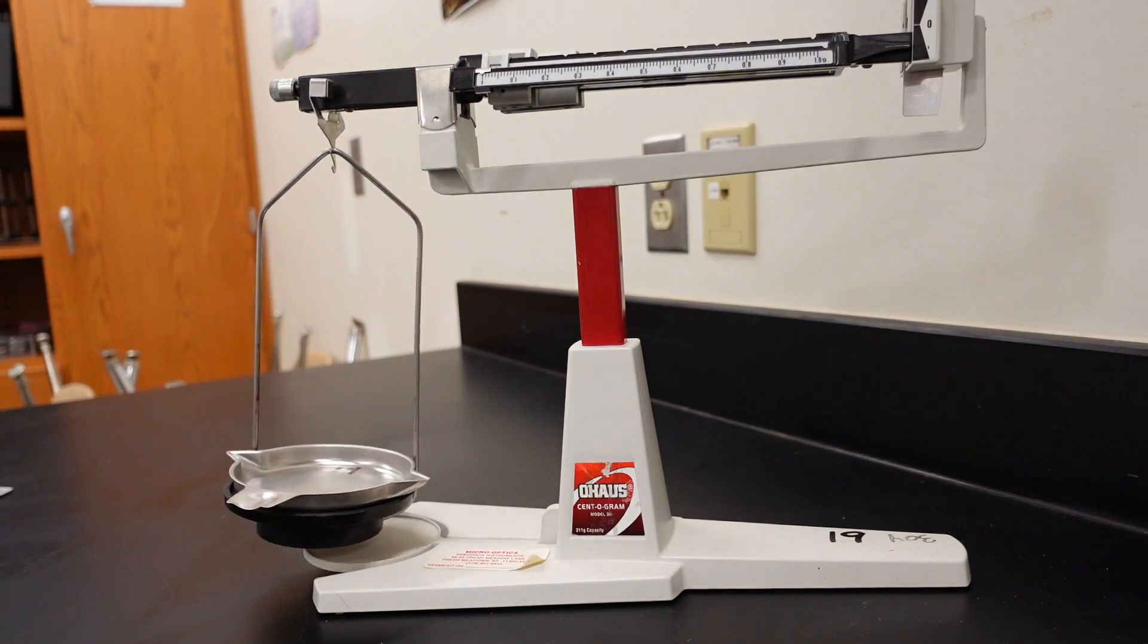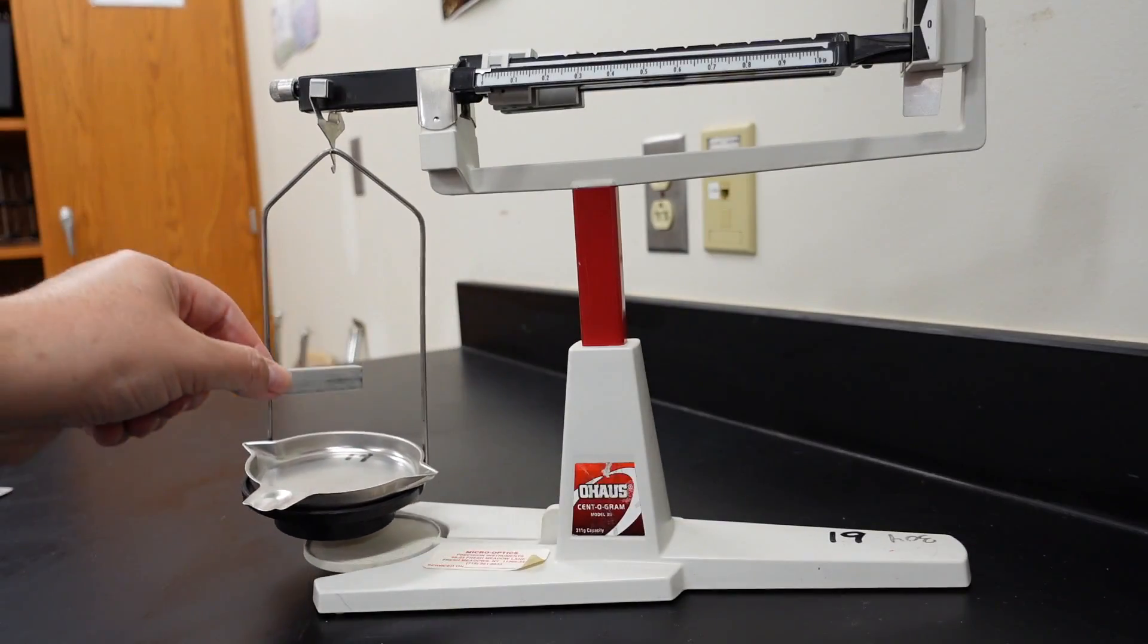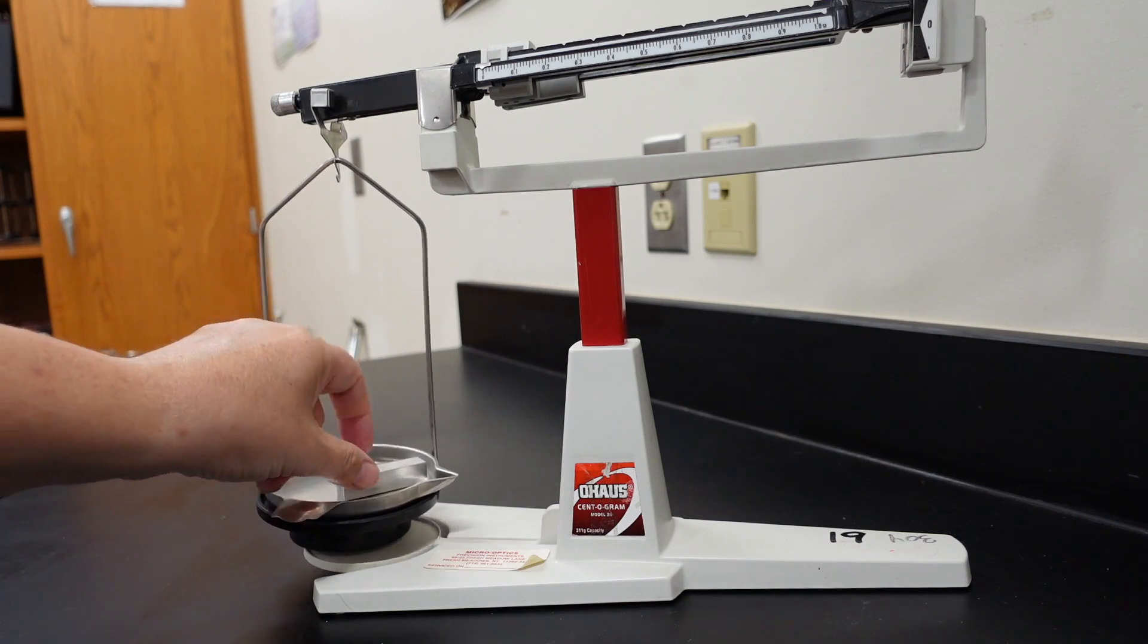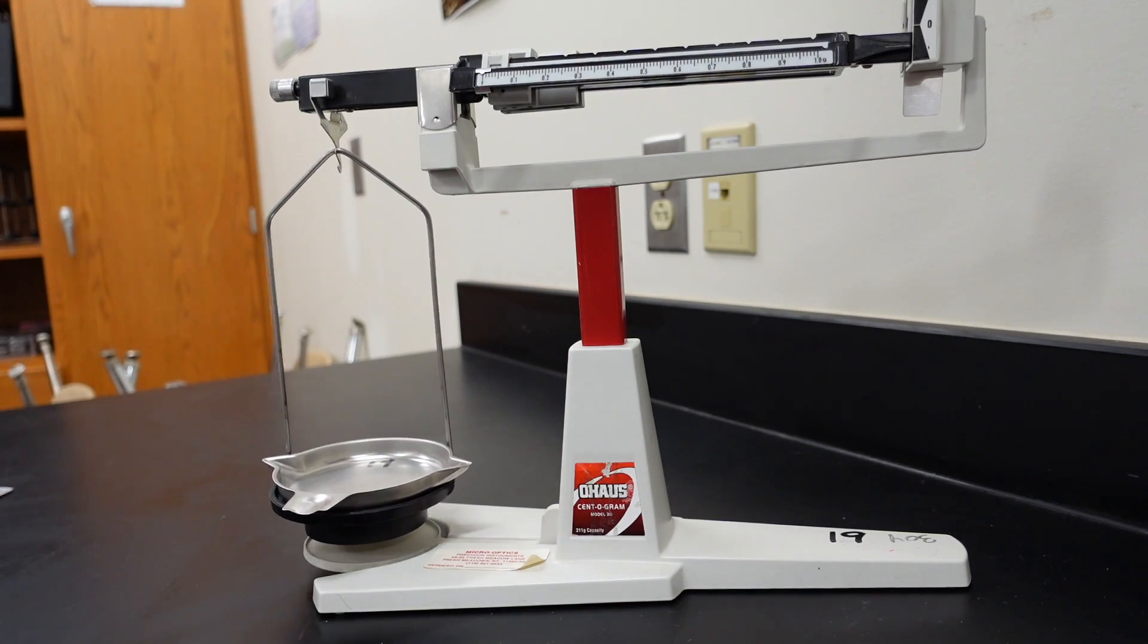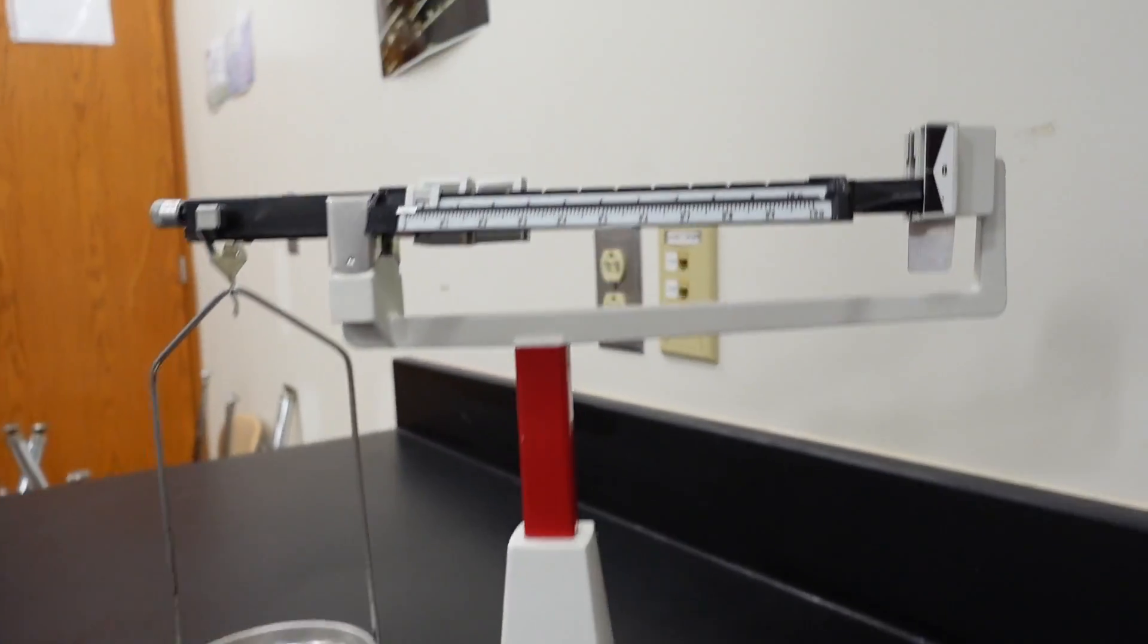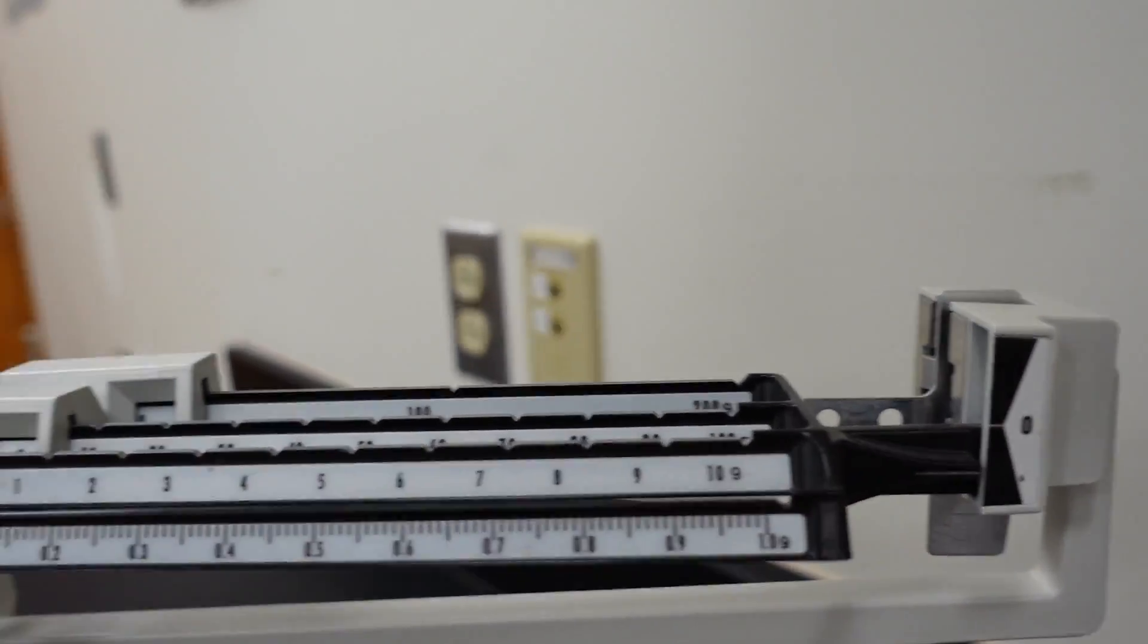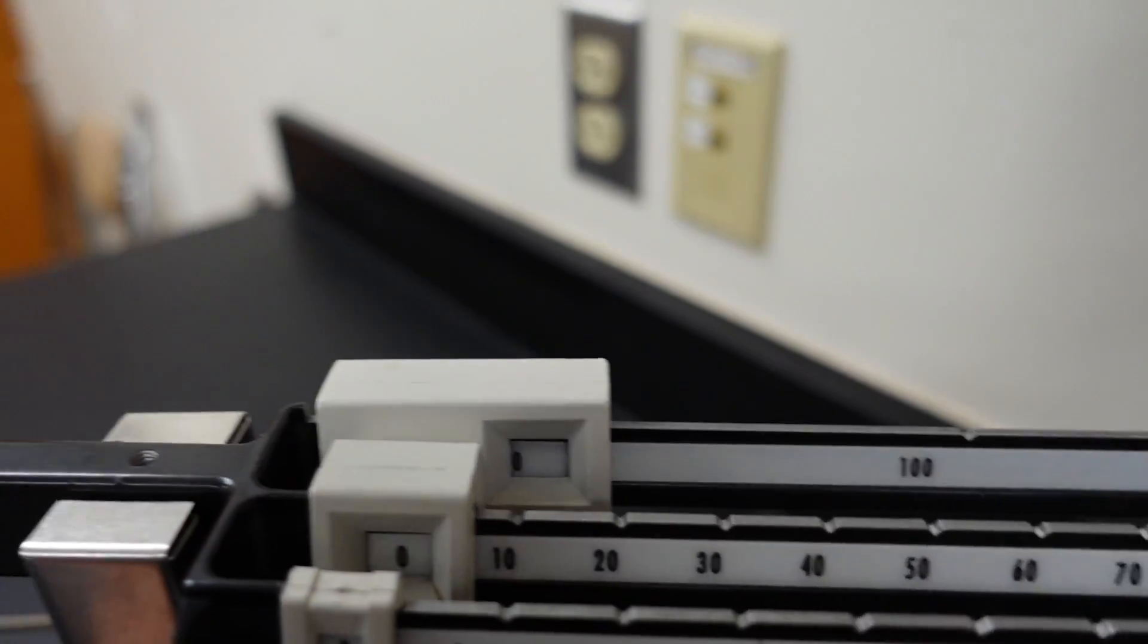So, what we do is we just take the aluminum block, and we place it on the balance plate. But, before we do that, we want to make sure that our balance is zeroed. And, as you can see, it is not zeroed. Now, why is that? Let's check these mass riders.